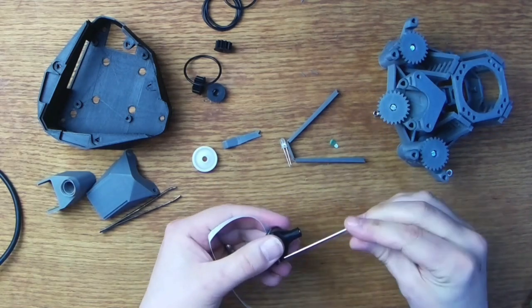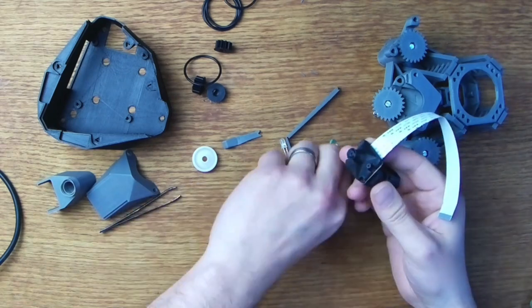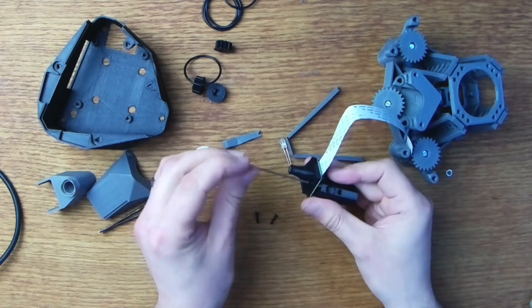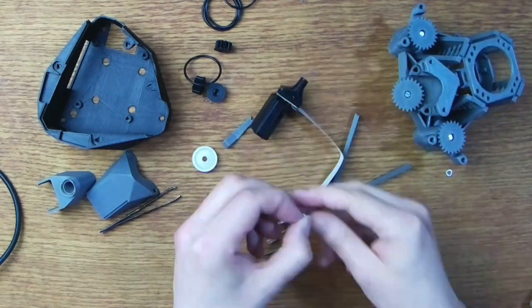However, a little locating feature or some indication to show the correct orientation would be a nice thing to add in a future revision of this design. Maybe something to suggest in the OpenFlexure forums.